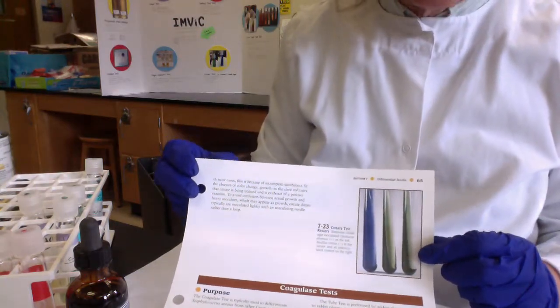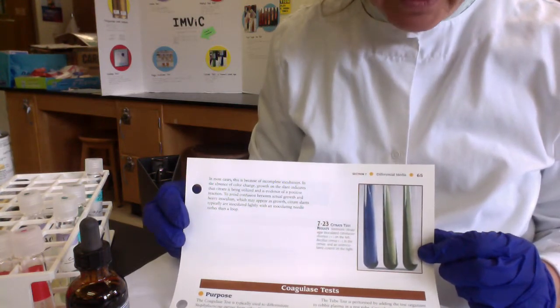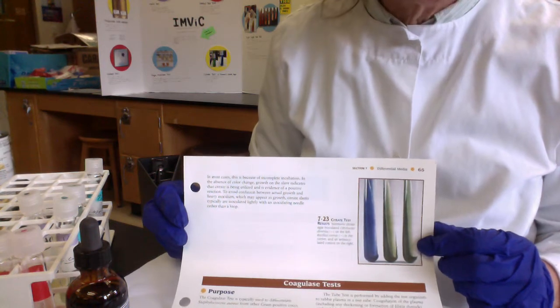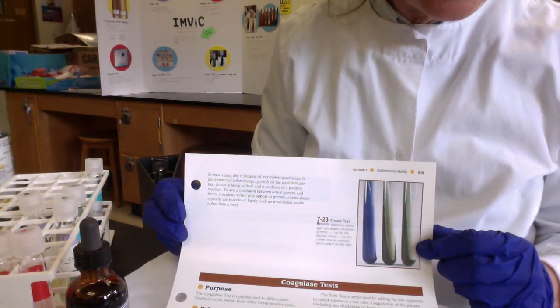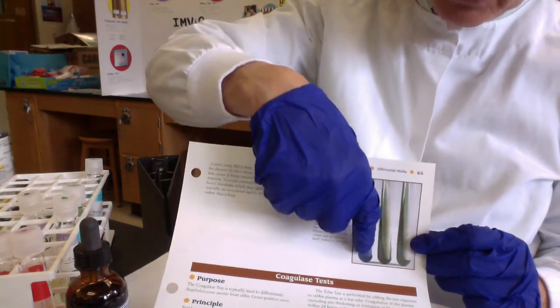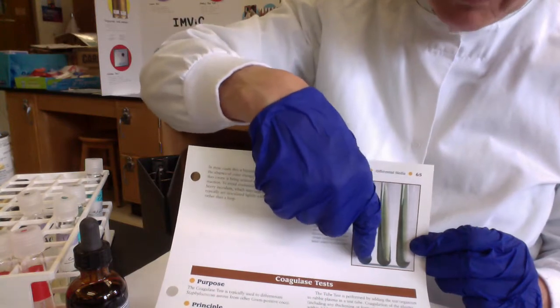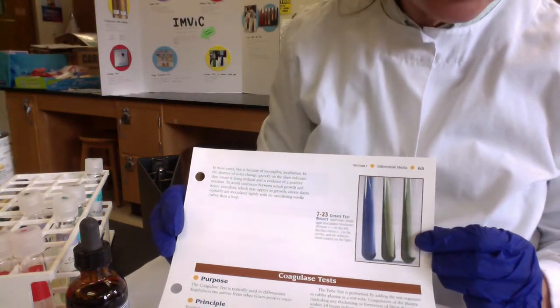It's got this really cool pH indicator in it called bromothymol blue. And if citrate is used as a sole source of carbon and energy, we'll get an alkaline pH, a high pH. And the bromothymol blue is going to turn this beautiful deep blue color, not red, deep blue color, sometimes called Prussian blue. I think of it as Levi jeans blue.